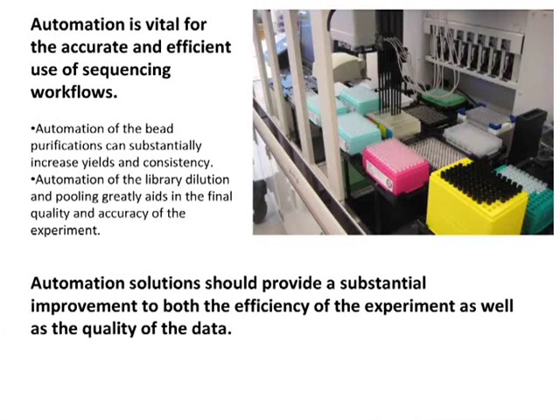But I should also emphasize that there certainly are workflows, certainly sample sizes, et cetera, that do not benefit from the automation when you consider the amount of plastics or the amount of time that it takes to set up the robot deck. The automation can be very, very helpful, but it isn't necessarily used in absolutely every case.